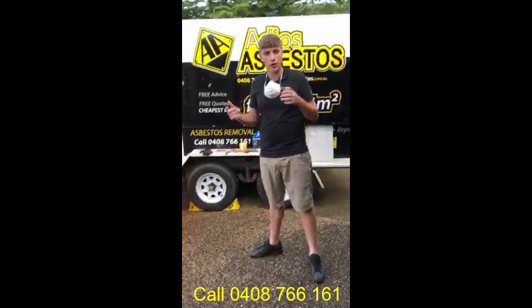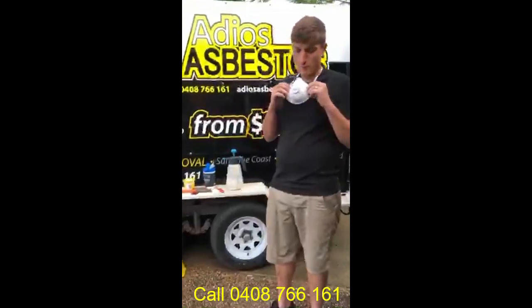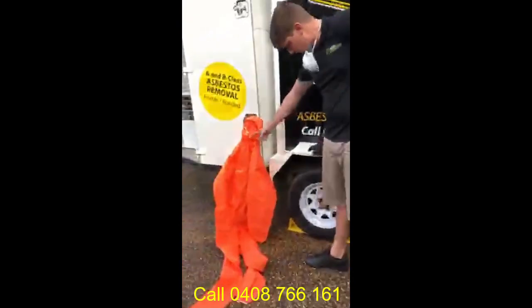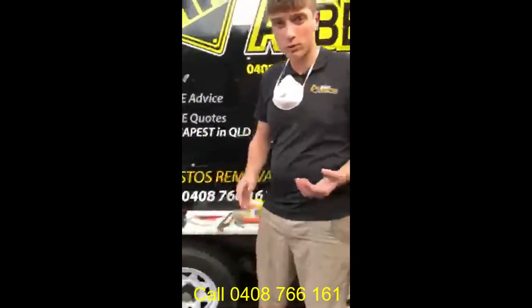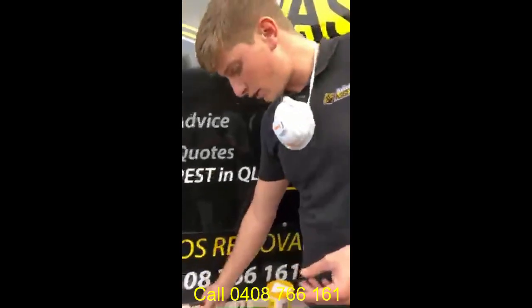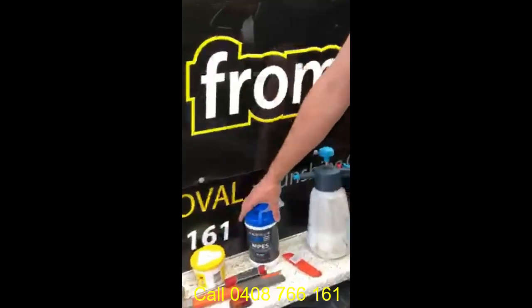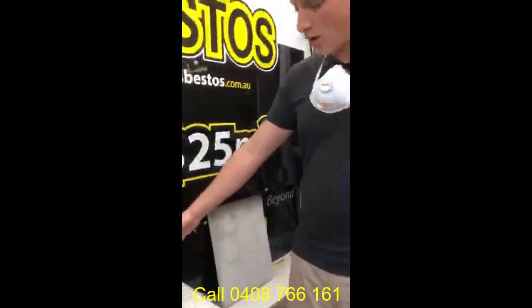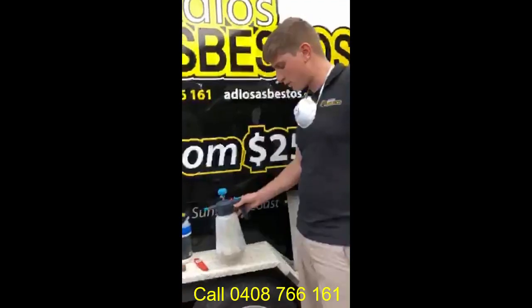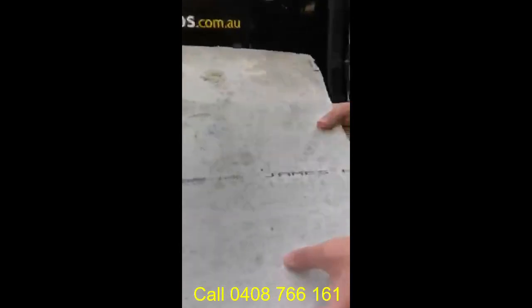In today's video I'm going to be showing you how to safely take a sample to identify if there is asbestos in the material in your home. As always, you need to be wearing the correct PPE: your P2 disposable mask, your Type 5 overalls and your gloves. Additionally, to take the samples, what we'll need today is a pen to write on, some Ziploc bags to seal the asbestos once taken, some vice grips or pliers, hammer, chisel, just some wood putty, alcohol wipes and a PVA particle binder. Obviously, like always, we dilute it at 20% due to the water ratio. And as always, we're using a non-asbestos product, James Hardie Fibro cement sheeting, with the Australian standard number and barcode, which definitely doesn't contain asbestos.